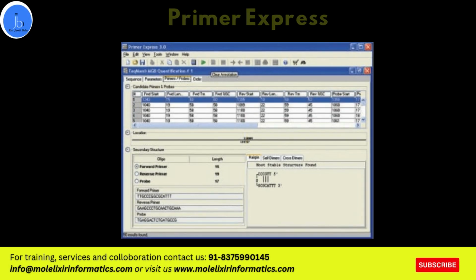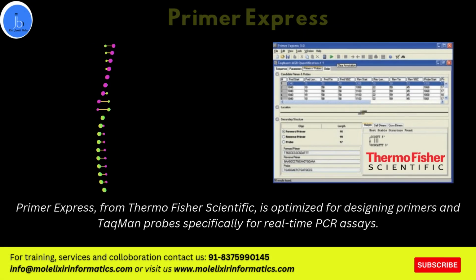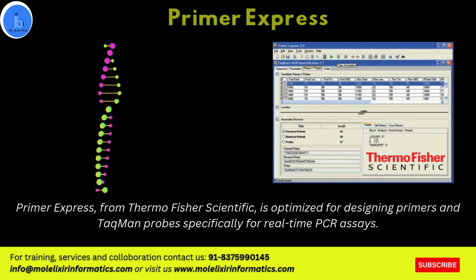And lastly, Primer Express. This one is used to design primers and probes for real-time PCR. Primer Express from Thermo Fisher Scientific is optimized for designing primers and TaqMan probes, especially for real-time PCR. This provides a comprehensive analysis tool to ensure high efficiency and specificity of the assays.